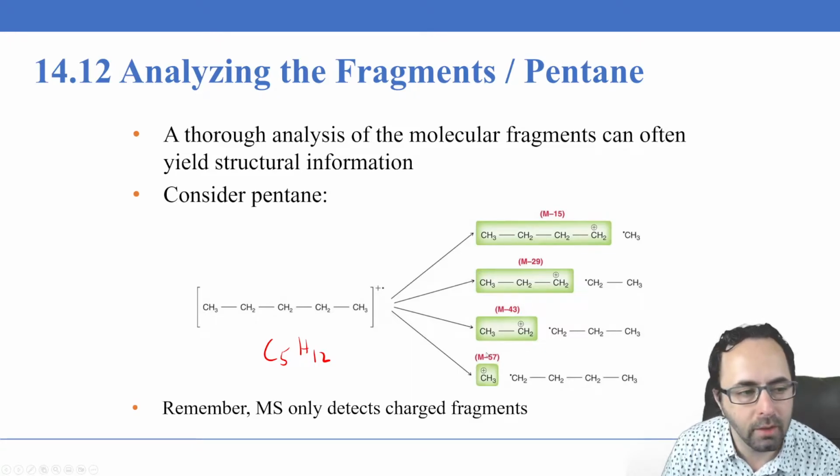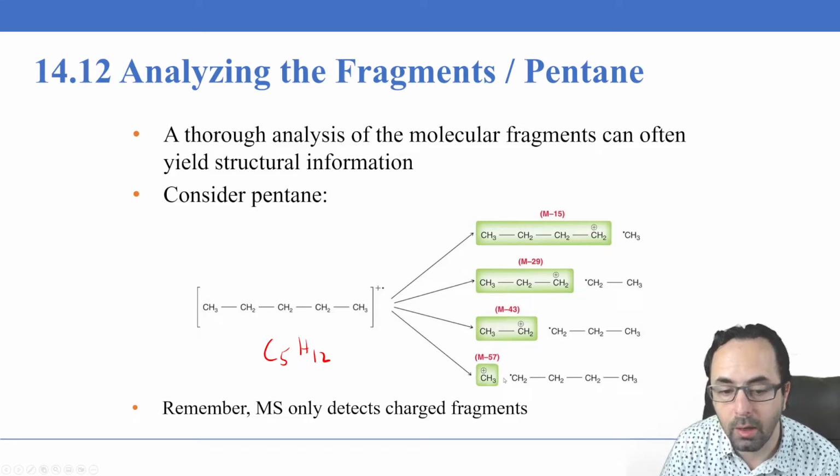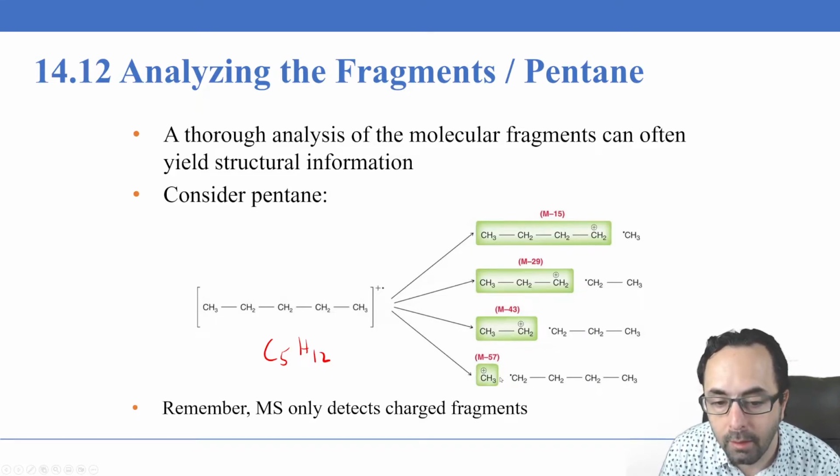You might be surprised to find that the relative fragmentation had not been directly observed, and so I had a special mass spectrometry technique that allowed us to cool down the molecule immediately after it reacted, to figure out where it would break with exposure to heat. Anyways, these are not breaking with exposure to heat; they're breaking due to electron impact ionization.